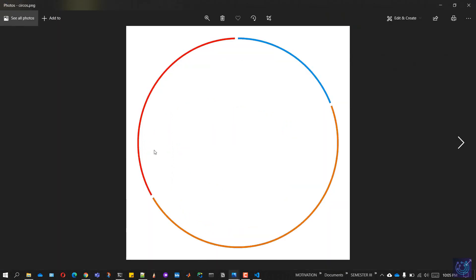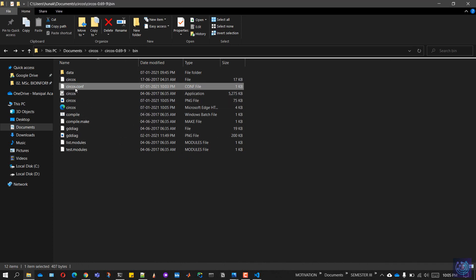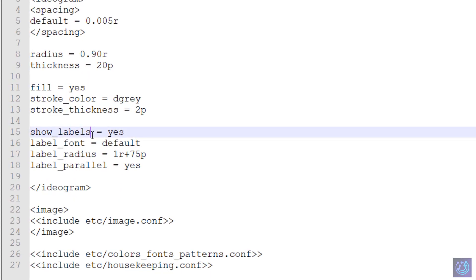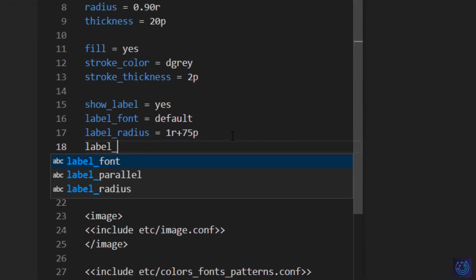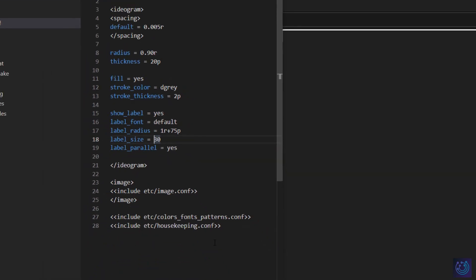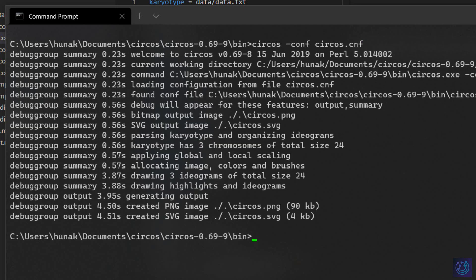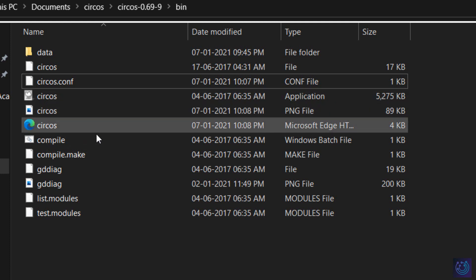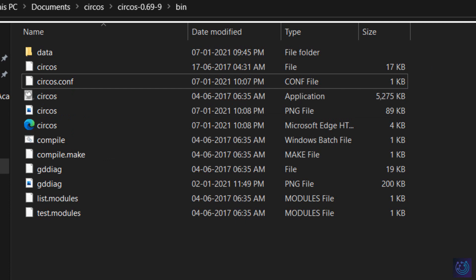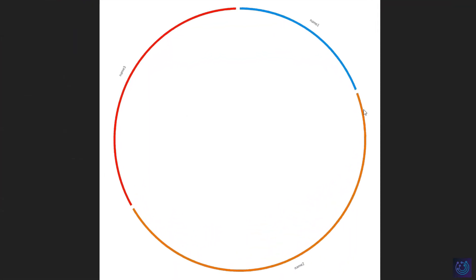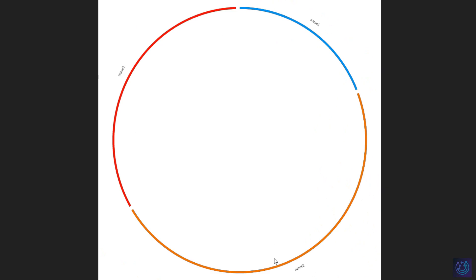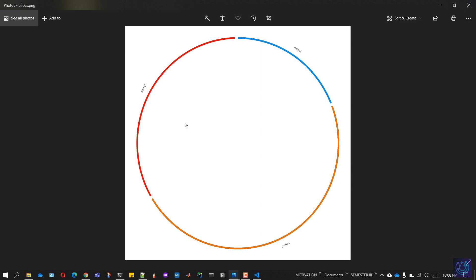Opening the image, we see the labels are missing because we missed a parameter. Going back to the conf file: it should be 'show_label' not 'show_labels'. We also missed 'label_size' — set it to 30. Save the file, clear the terminal, and run the Circos command again with the updated 'circos.conf'. Note that the images in the folder will be overwritten, so rename or copy them if needed. Viewing the new image, the labels are now visible. That was it for this video — hope you liked it!